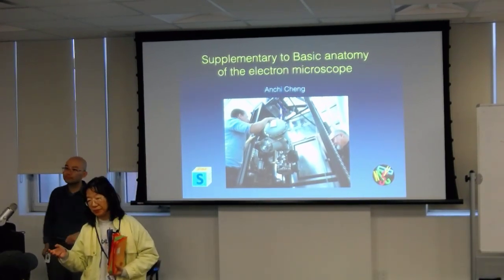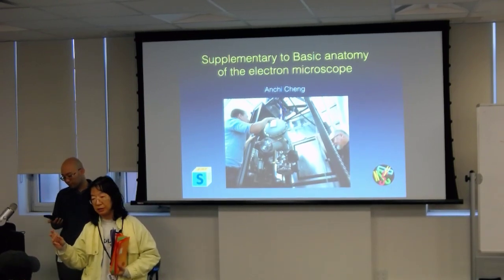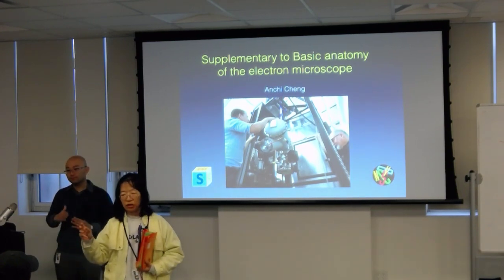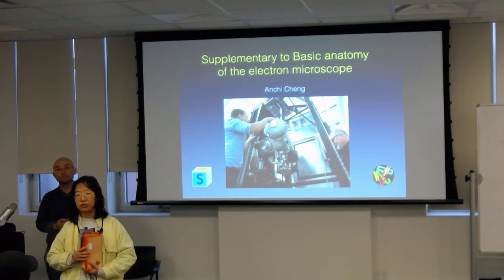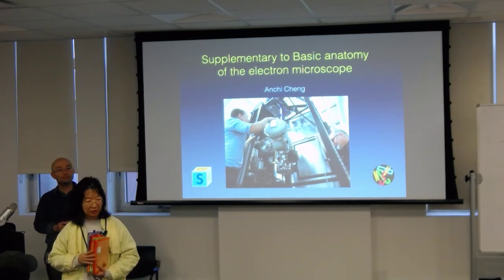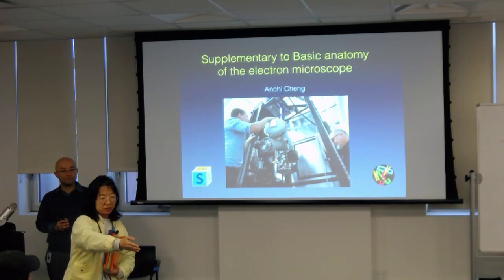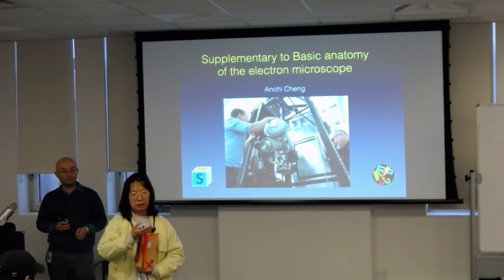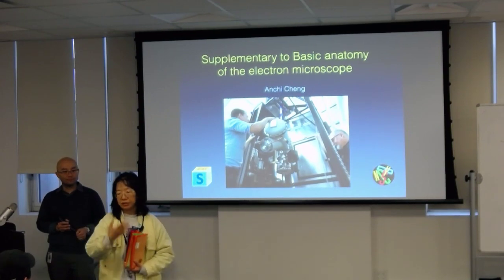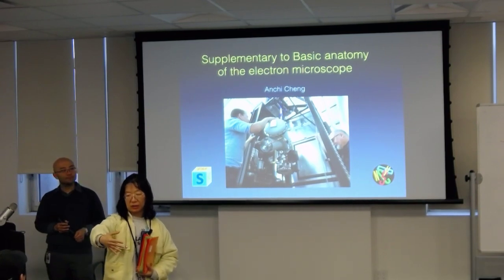Detector. More specifically, it's a direct detector with counting capacity. So if I'm going to have a microscope and I need to get high resolution data, I would prefer his microscope than your microscope, just for the detector. The CCD camera cannot give me as much signal output from my input.